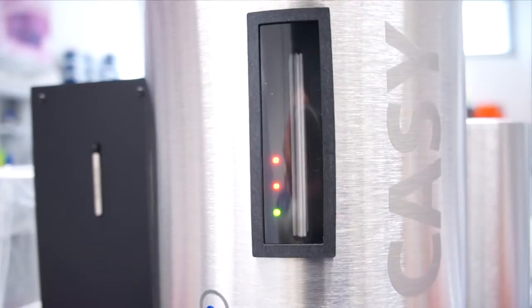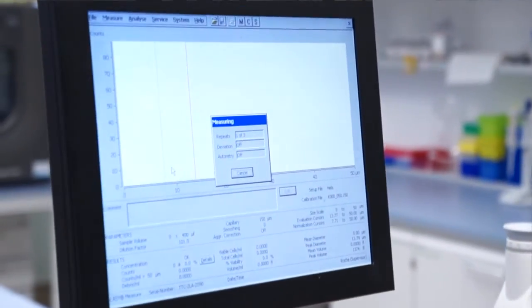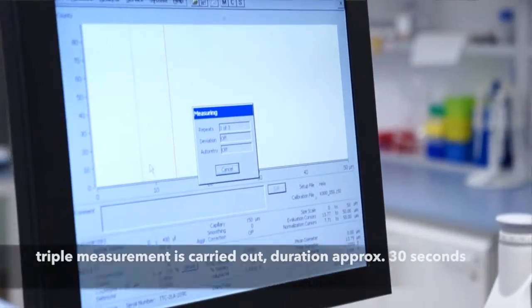To obtain sufficient statistical certainty, we carry out a triple measurement, which takes about 30 seconds.